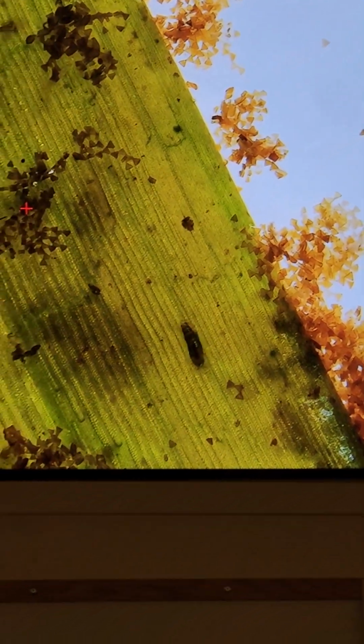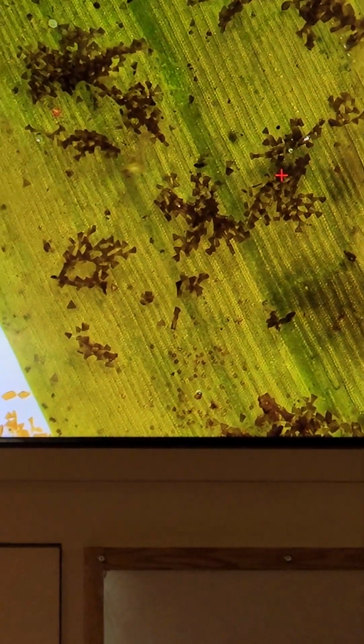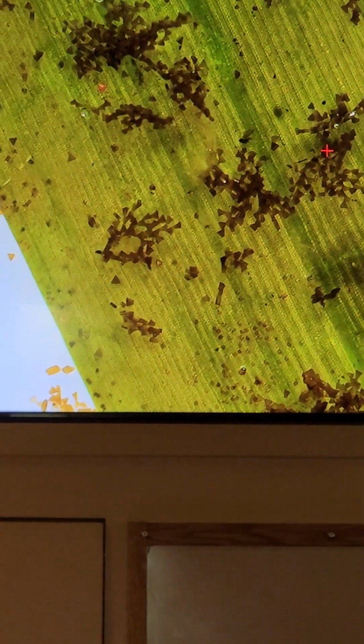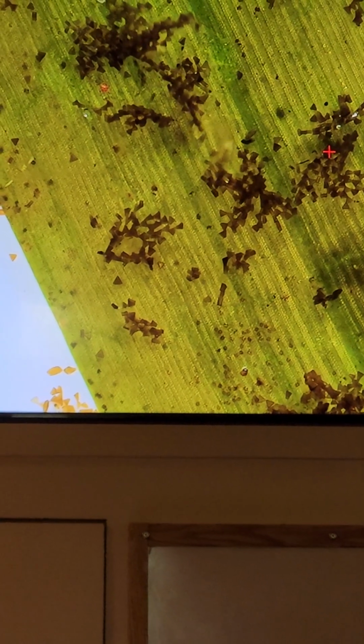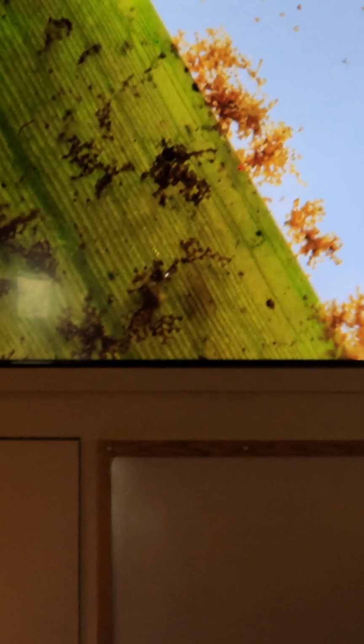What these caprellids do, they look like a stick bug underwater, is how I would describe them, and they move like inchworms, as you can see. They have a claw-like foot at the back that they use to grip surfaces, and that gives the top part of their body free rein to wave, and they look like inflatable wacky waving tube men when they're waving through the water column. These guys are feasting right now. These are freshly born too. I think we had a pregnant caprellid on this piece of eelgrass. I just grabbed this out of our tanks.